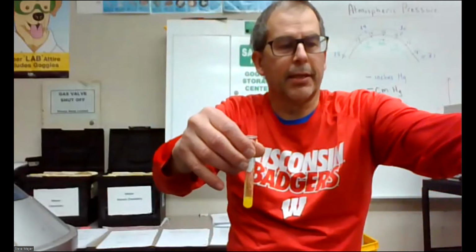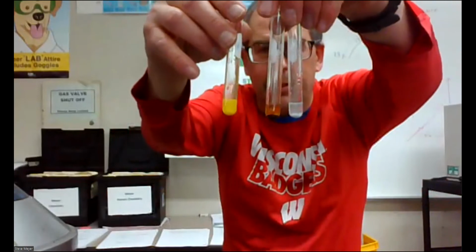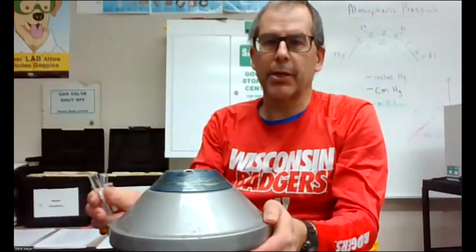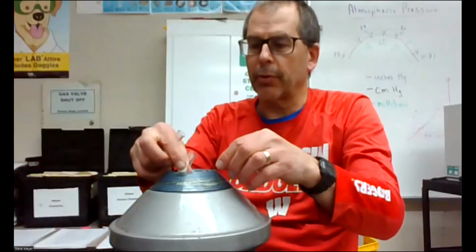Looking at these, they are precipitates, and they look like they're starting to settle. I can speed up that process by putting them into a centrifuge and spinning them around real quick. The heavier solid, or precipitate, is going to be pushed to the outside with more force than the lighter things. So we're thinking the heavier precipitate will go to the bottom, and then we'd be able to separate these things. All right, I think that's probably good.